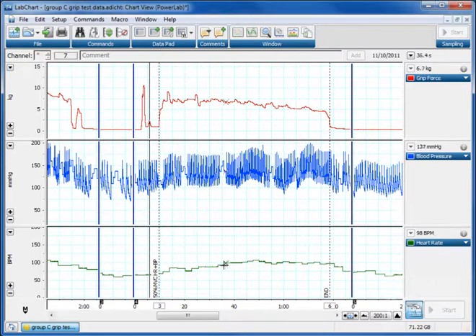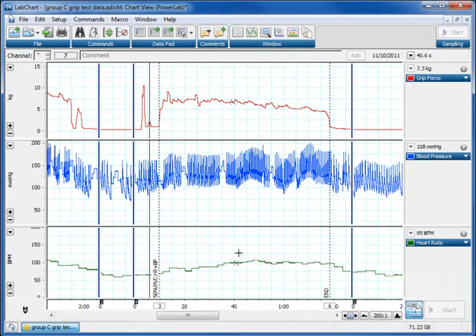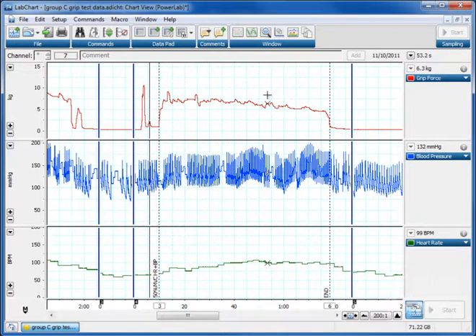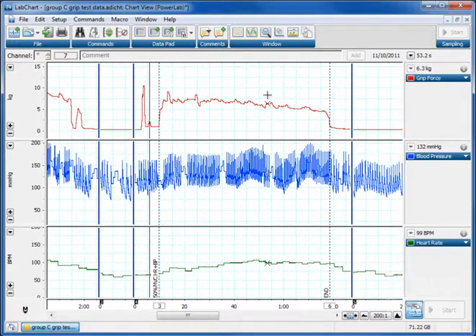In some of the previous tutorials and in the lectures and practical sessions, you've probably seen the use of things called DVMs or digital voltmeters, essentially little windows that hover over your data and show you the real-time data as it's been collected or analyzed.